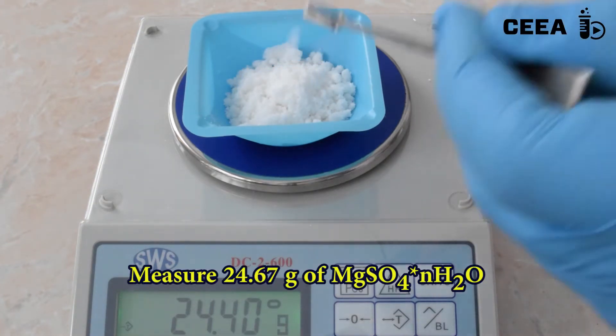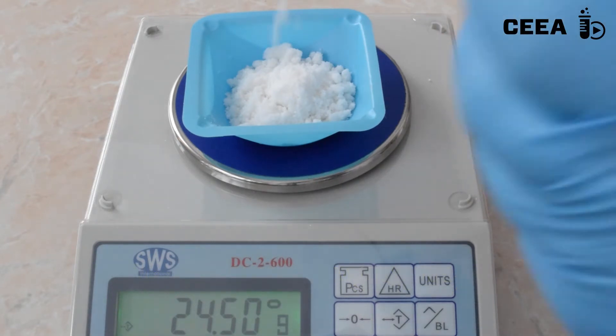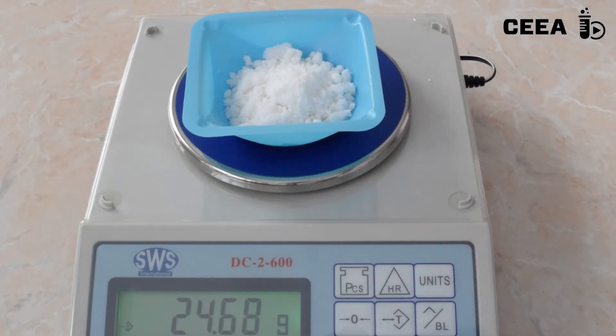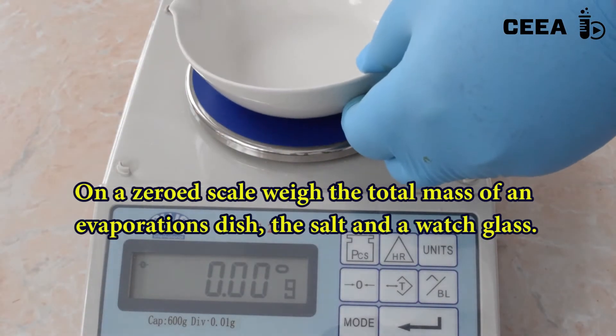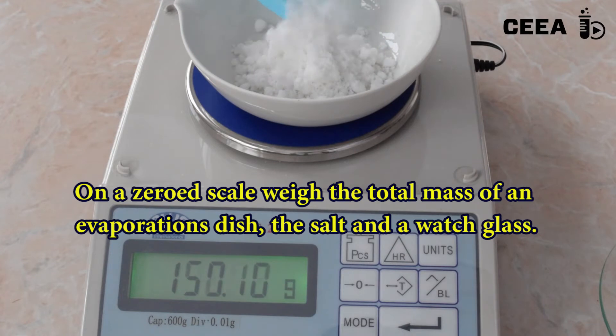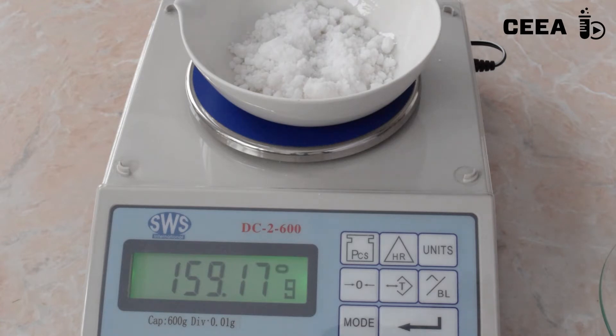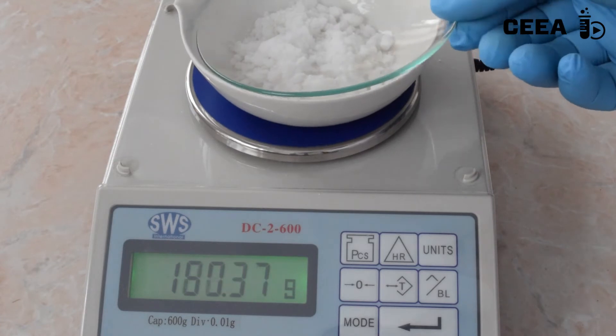Take 24.67 g of hydrated magnesium sulfate. Put the salt in an evaporating dish, covered with a watch glass, and weigh the entire mass.